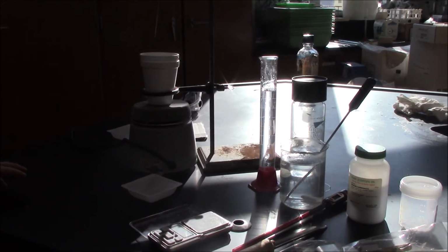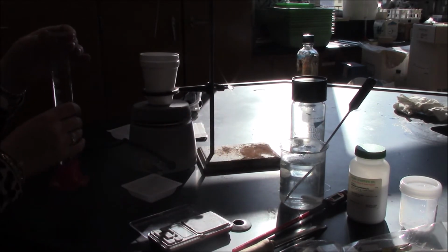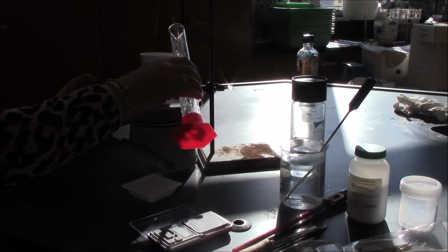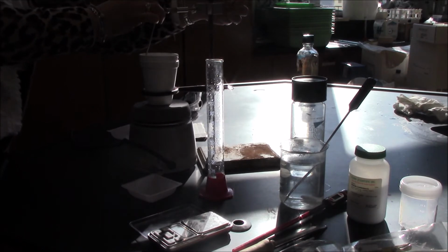Okay guys, I'm back for the calibration part. What I've already done is measured out 100 grams or 100 milliliters of cold water. I'm going to add it to my calorimeter. I'm going to set it to stir. And I'm going to measure my initial temperature here.